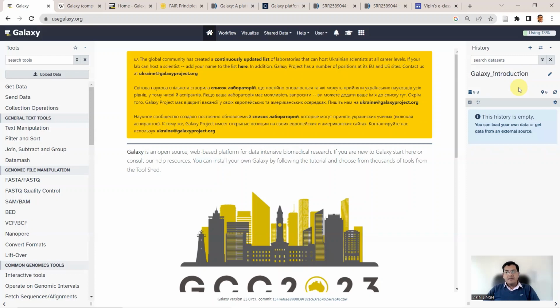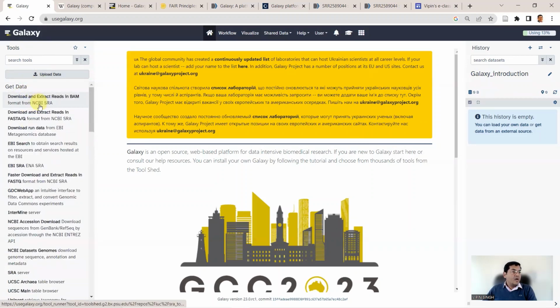you to Galaxy. So as I said, there are three main compartments. So on the left-hand side, there is the tool shed from where you can select the tool that you want to use. Also, you can upload your data through the upload data option here. Likewise, you could also download your data from here. So if you click on get data, it will ask you to download, options will be available to you, right? Then, of course, on the right-hand side, you have the history panel, which shows you the exercises that you've done earlier. Also, it allows you to create a new history, which is your current program. And then, of course, the processes that you do in this particular history will line up here as we move forward.